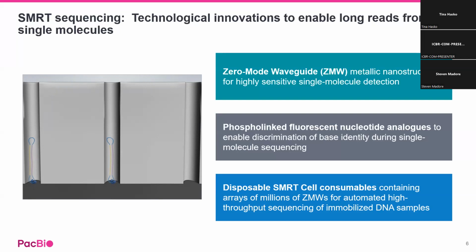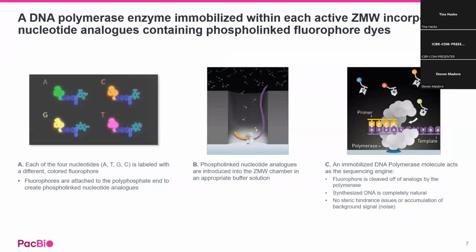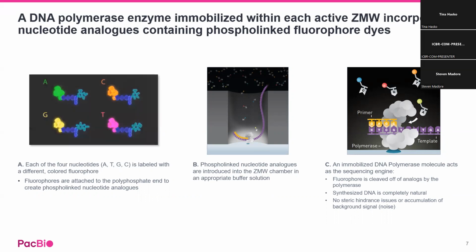And because it's distributed that way, you can be sure that you have a single molecule read, a very long read, very accurate. The signal is detected by a specific fluorophore attached to a specific nucleotide. And this is again how it works. I really like this video, but I don't think we need to dwell more on that. You can see that this is a very elegant and very simple solution for what we now call third generation sequencing.